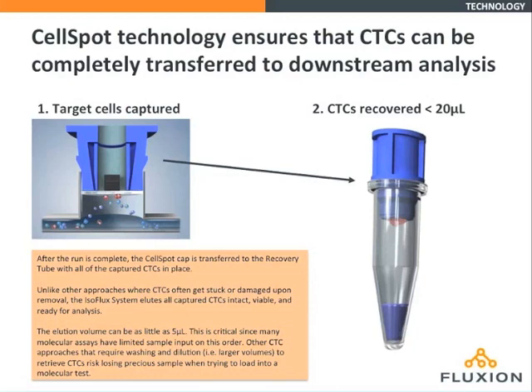A big challenge with microfluidic approaches previously, as I've alluded to, is that the cells don't just need to be captured and counted, they need to be efficiently recovered off chip, and there's often loss during that recovery step. The way we address that is by not having to remove the cells from the substrate. So what happens is this substrate that seals the top of the fluidic channel is removable.